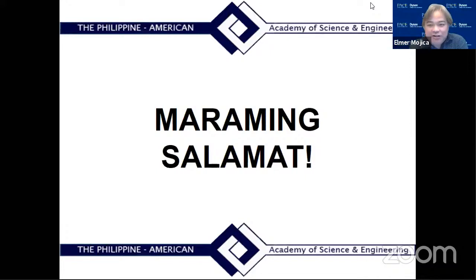So we always run this toluene as our standard to see if the instrument is always aligned. Especially in the big Raman, it doesn't have a standard. Like we're the one who have to find where we need to put the line. Okay? And Jason was really good on that thing. That's why when I saw that he was able to get a signal that is 1,000 or 10,000 times better than me, I always said, can you prepare the big Raman for me when I go there?